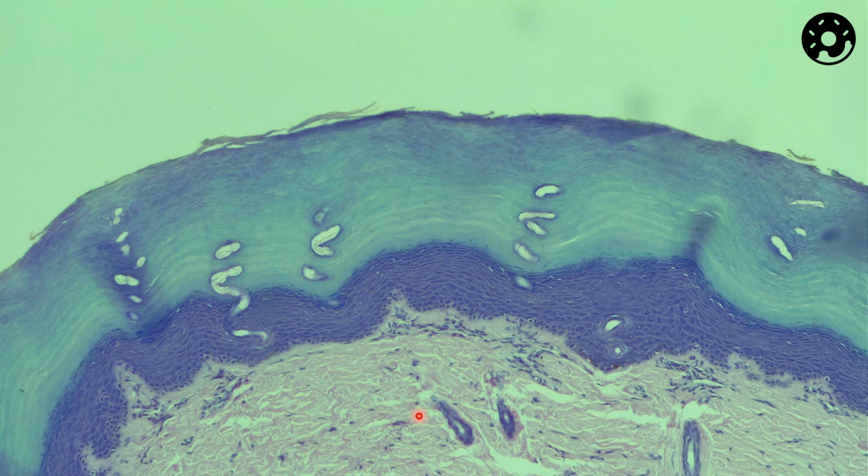So not focusing on this connective tissue down here, but focusing on from this dark purple up, we have the different strata, okay? So the top layer that we have here is Stratum Corneum. Stratum Corneum is going to go from here to here. And again, this is thick skin. And we know it's thick because just look how thick this epidermis is, okay? How many layers there are, 30 plus layers. So this is the Stratum Corneum right here.